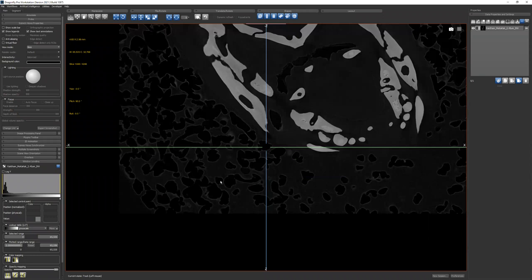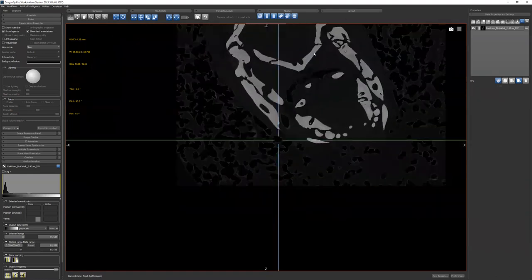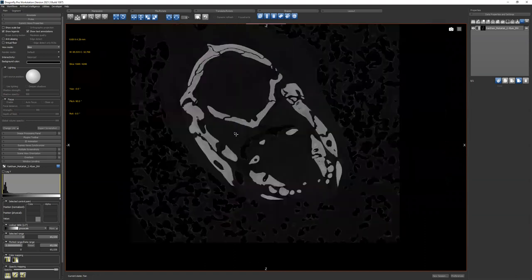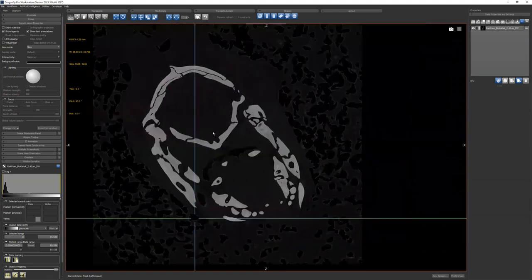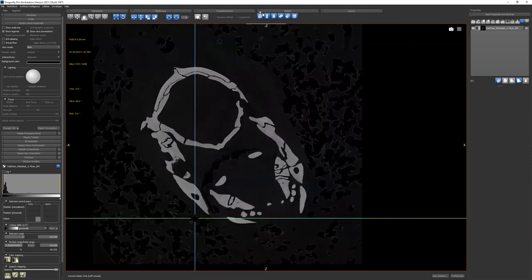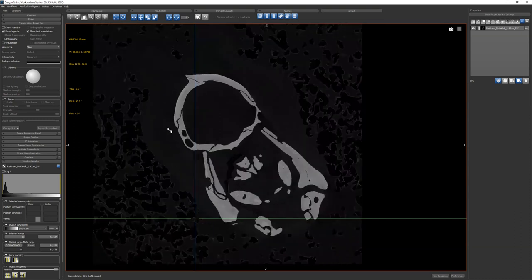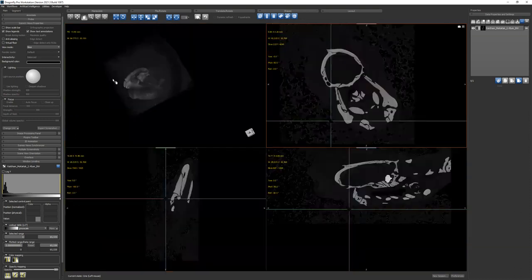And there's all these mouse shortcuts. So if you use the scroll wheel, click and then drag up and down, it will magnify. If you use both mouse buttons and click and drag, it will move things around. And if you just scroll with the scroll wheel, it does nothing apparently. But you can click here and choose these different controls and then click and drag, for example, through your sections. Yeah. And the way that you look at 3D is slightly different.